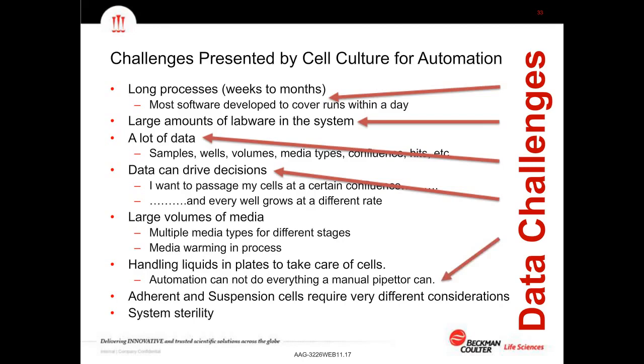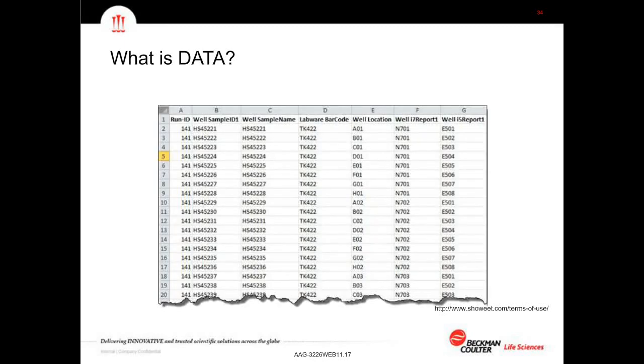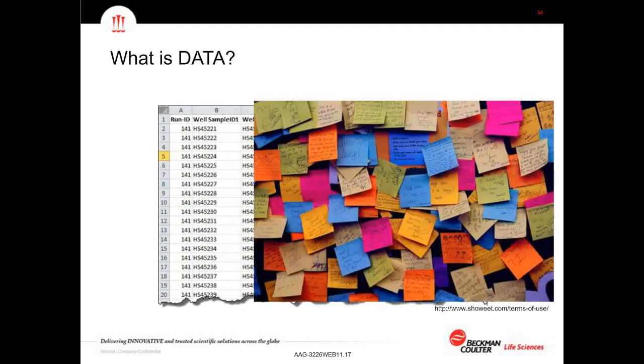So that we're clear, there's a lot of different ways to look at data. What are some things that I see? Certainly you bring information in from an Excel spreadsheet or from a LIMS system, but there are also more informal types of data, which is important, but can still become useful as you're looking back at your results later. Now, what was my lot number? Did I write that down?